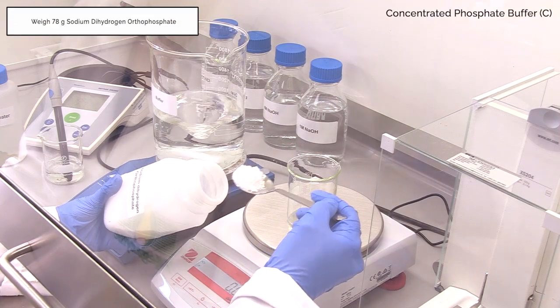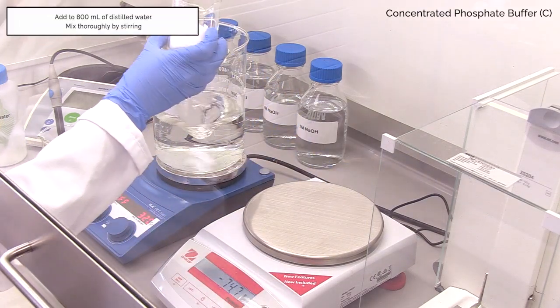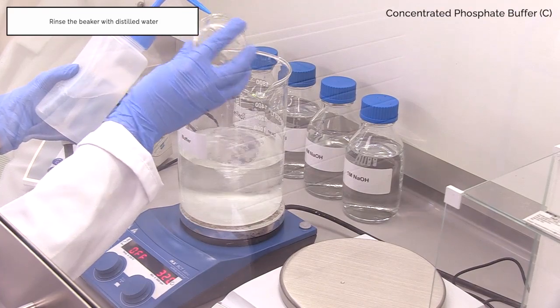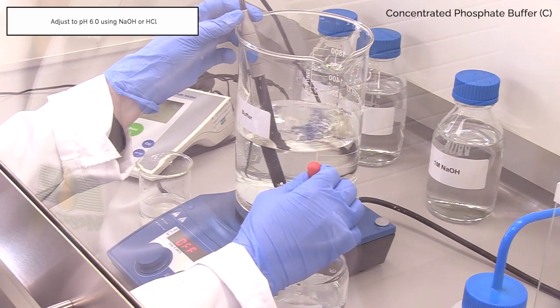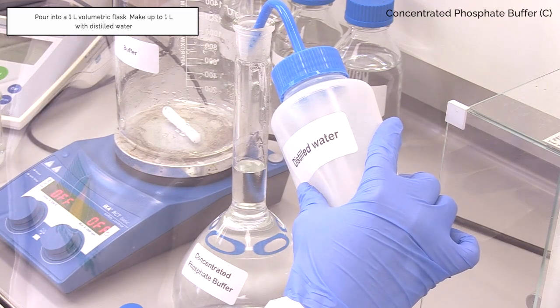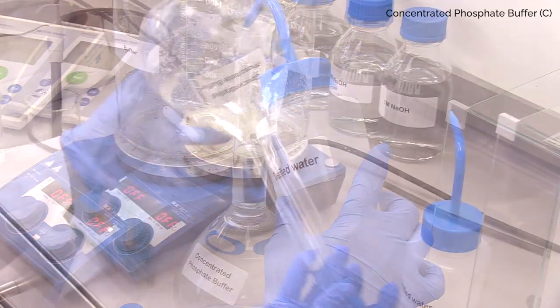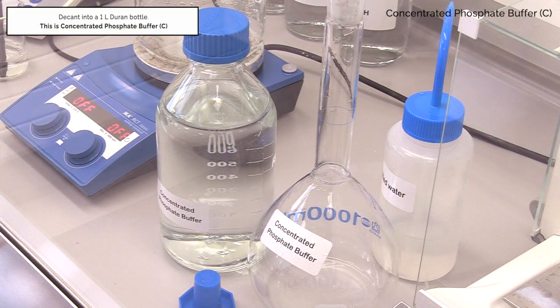Weigh 78 g of sodium dihydrogen orthophosphate and add this to a stirring beaker of 800 ml of distilled water marked buffer. Wash the original beaker into the 800 ml of distilled water using a wash bottle. Adjust the pH using 4 M NaOH until pH 6 is reached. Pour into a 1 litre volumetric flask and make up to 1 litre with distilled water. Invert to dissolve. Decant into a 1 litre Duran bottle. This is concentrated phosphate buffer C.